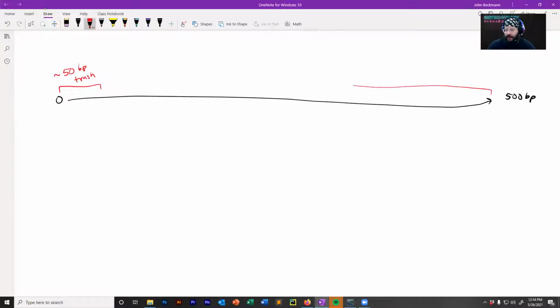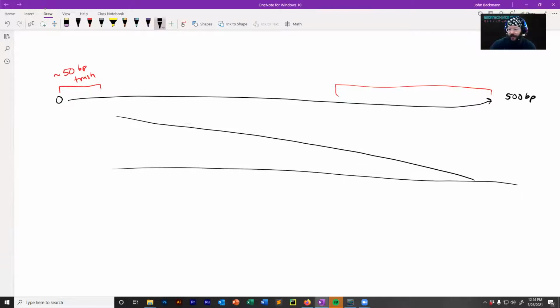And typically, as you go through this and look at the chromatogram, the peak intensity slowly decreases. And there's a point at which the peak intensity is so low that now the data is unreadable or not properly interpretable.